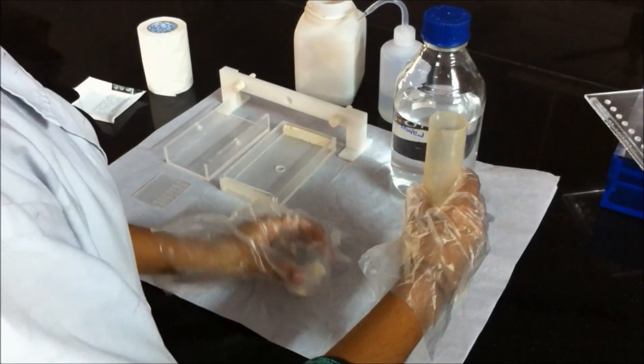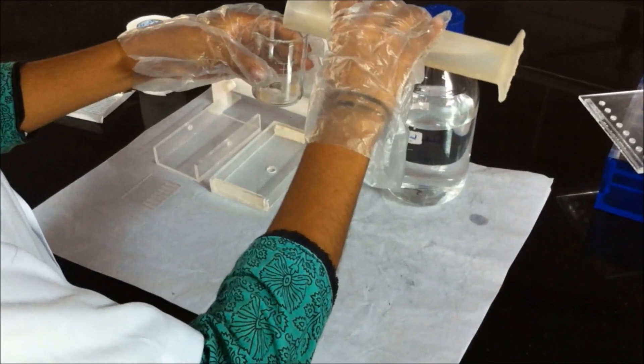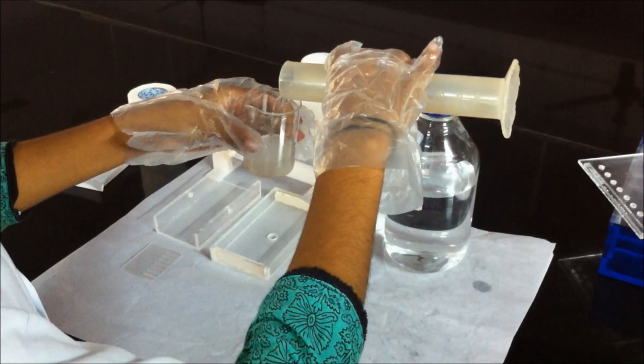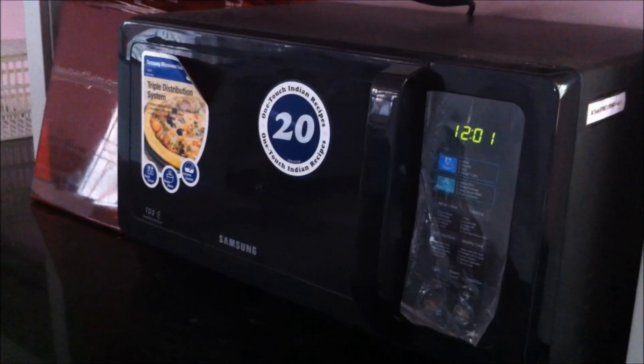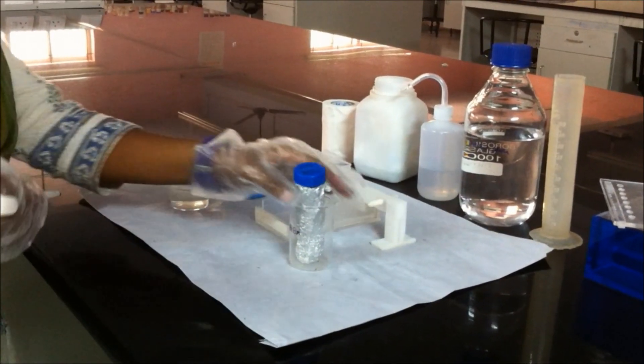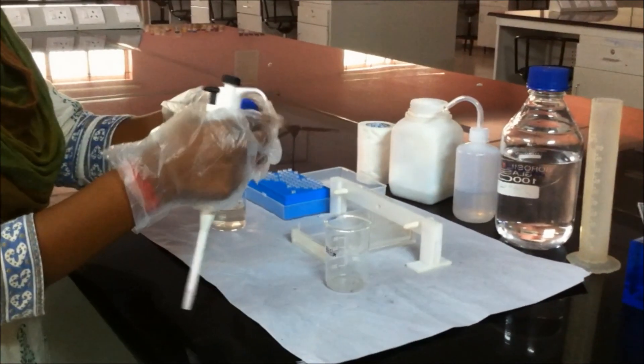Add 1 g of agarose in 100 ml of TBE buffer. Melt it in microwave oven.